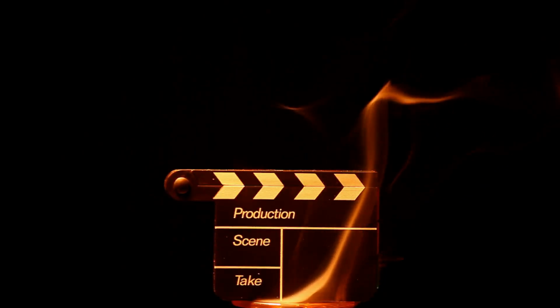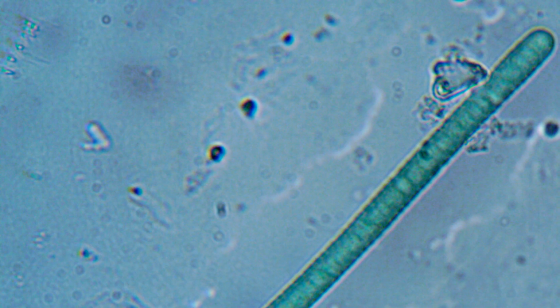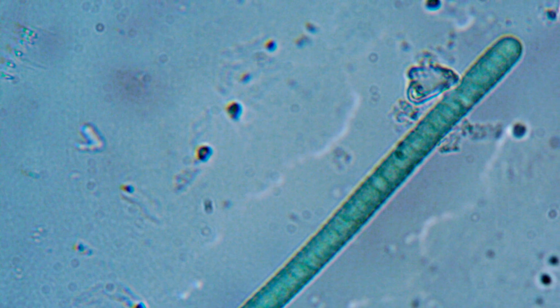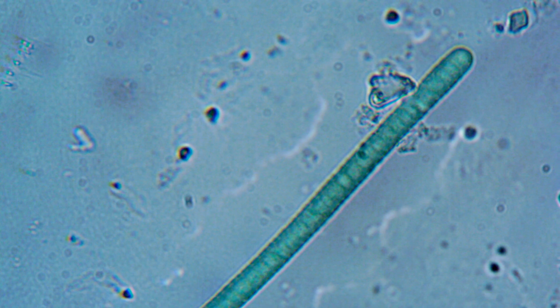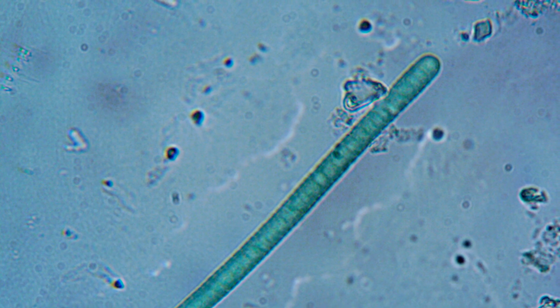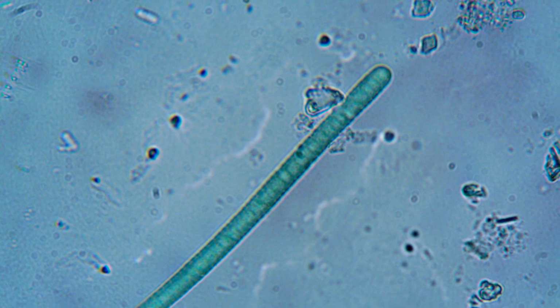Section 4. Seeing is believing, a tale of two images. The most obvious difference is the image itself. When you look through a light microscope, you can often see color, natural color, like green chlorophyll in a plant cell, or color from stains scientists add to highlight parts. Stains make images vibrant and easy to read. Nucleus stained deep purple. Cytoplasm stained light pink, a world of color.